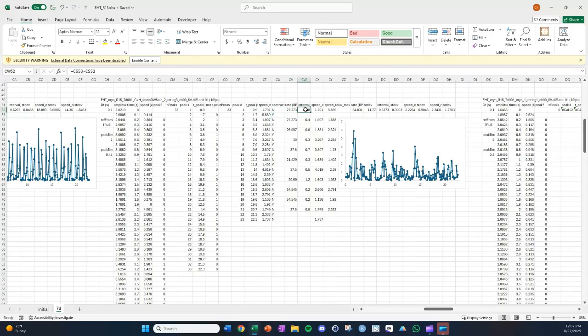So if I were to, and sometimes you need to do this, go in and correct the formula, because the formulas I have here are for whether these peaks are starting with contraction, but here putatively it's starting with relaxation.